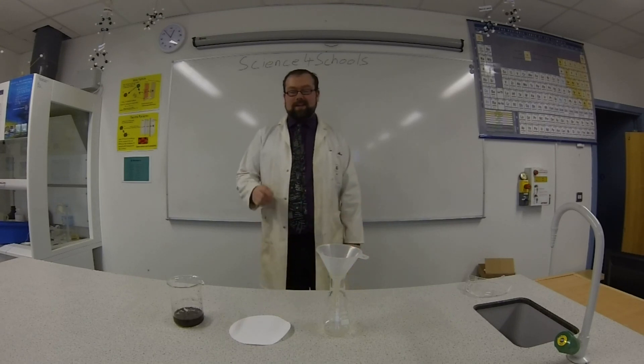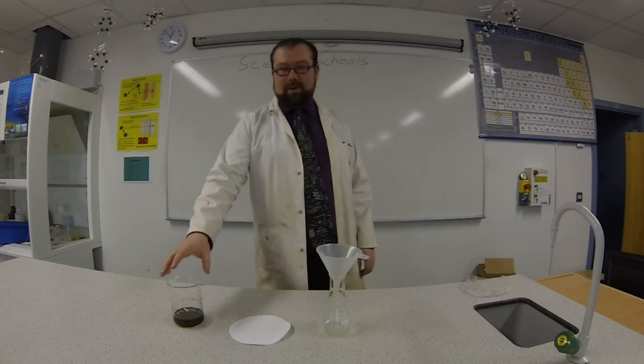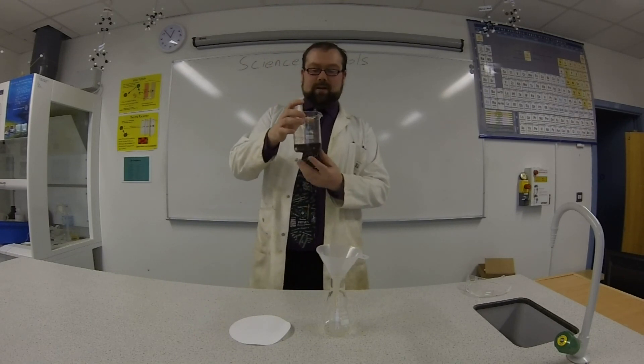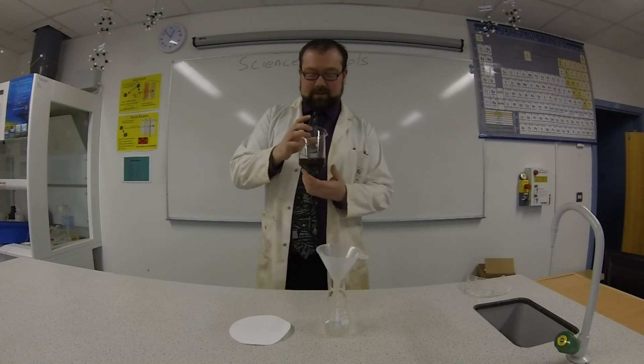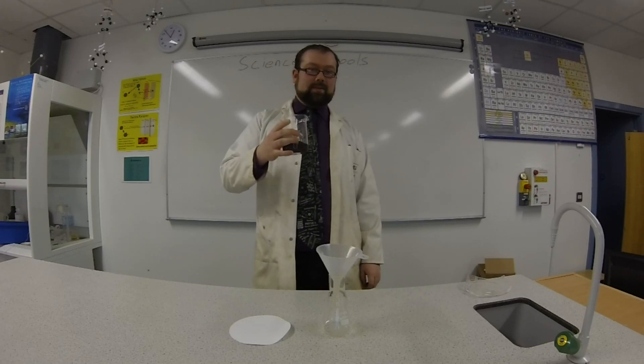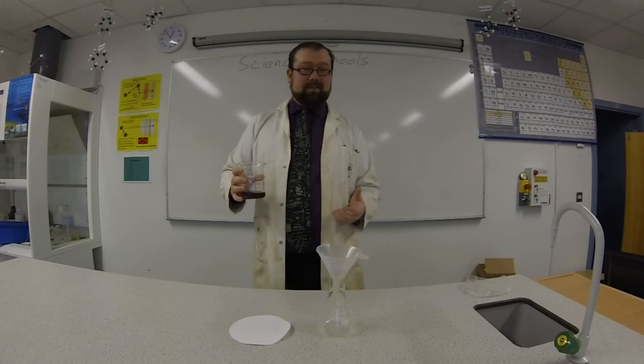Hi, welcome to Science4Schools. Today we are going to be separating a mixture by filtration. Here we have a mixture — nothing has dissolved in there. It's a load of dirt, there's some plant matter, there's even a seed in there. None of that has dissolved in the water, and this is good because filtration can't get rid of anything that's been dissolved.